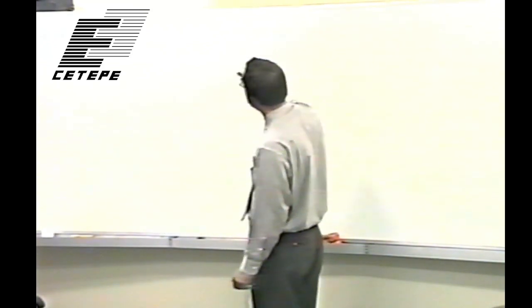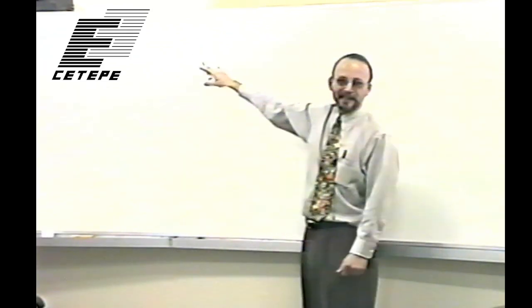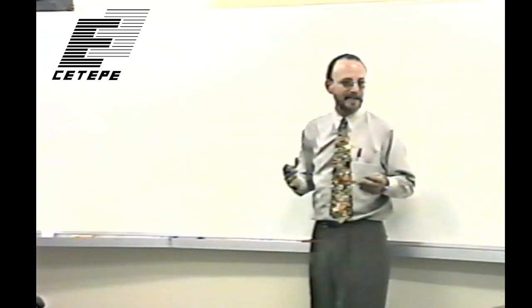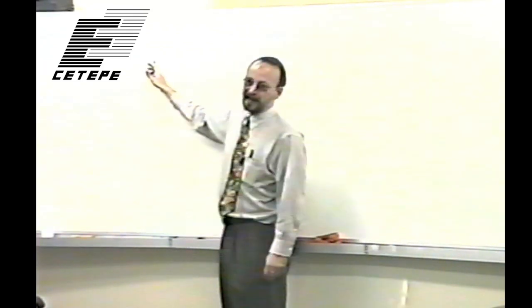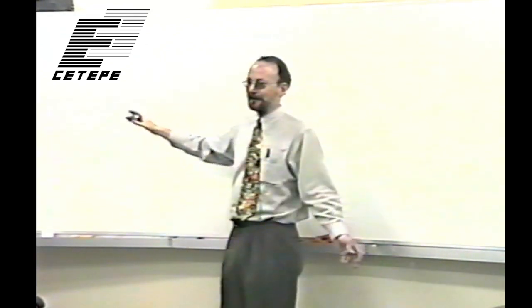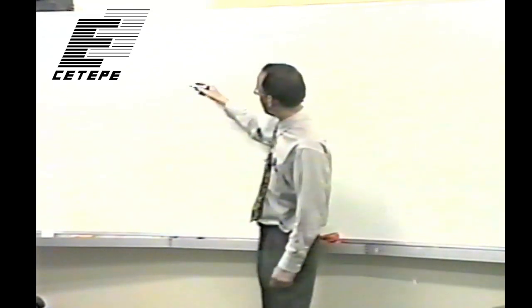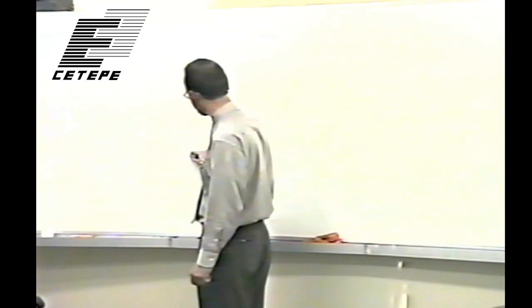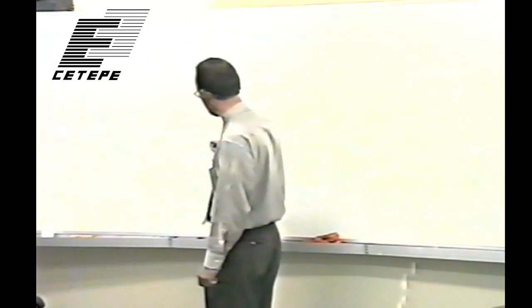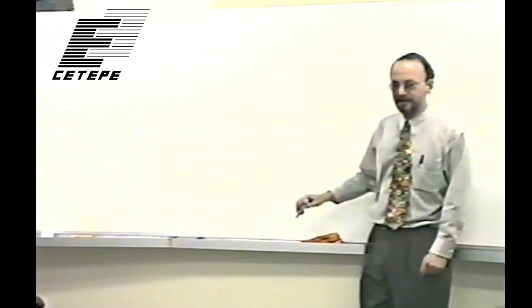Okay. Obviously I'm using K edges loosely, because the most important edge is the K edge. Strictly, this is a K edge, and this would be an L edge. But no one ever talks about L edges. You just call them all K edges. But in the case of iodine, this binding energy here is about 33 keV. I think, if I'm not making a drastic mistake, it's around that energy.